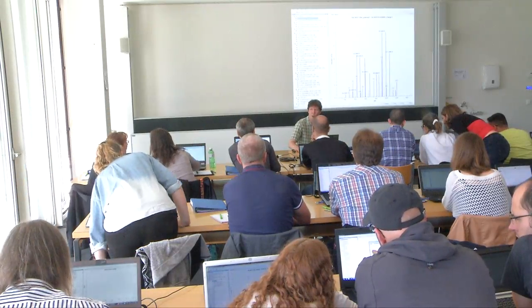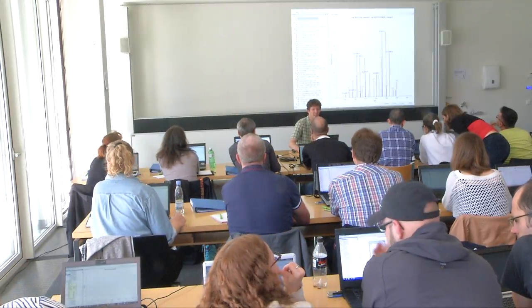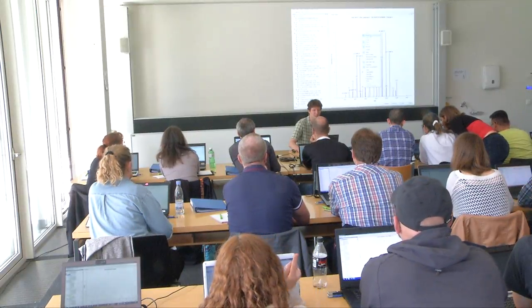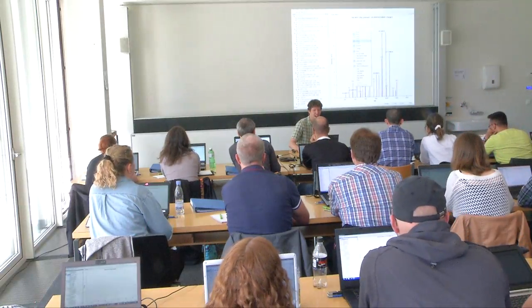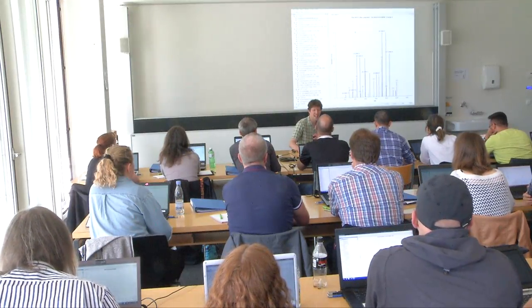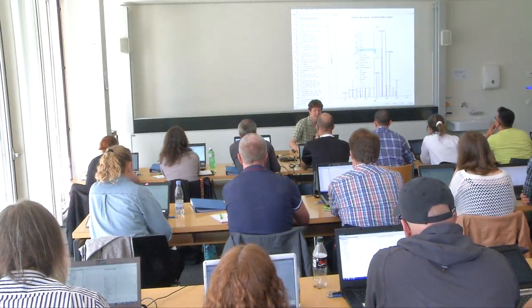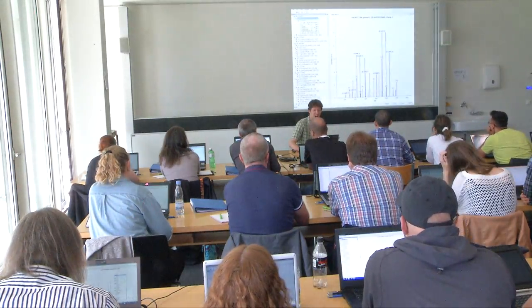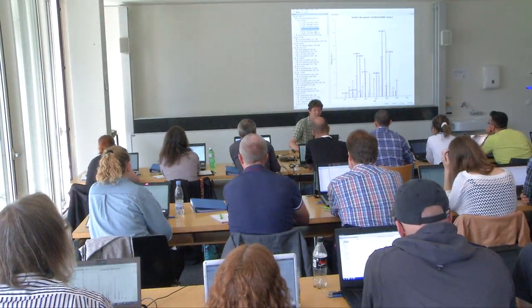All right. If when you come to this spectral library view you don't see the blue B ions, you can turn them on by right-clicking on the graph, and then clicking B ions. I just turned them off, and I can turn them back on. I can also choose charge states 1 and 2, as I have here, and this is what that graph looks like. If you select through these transitions, Skyline will highlight each one.